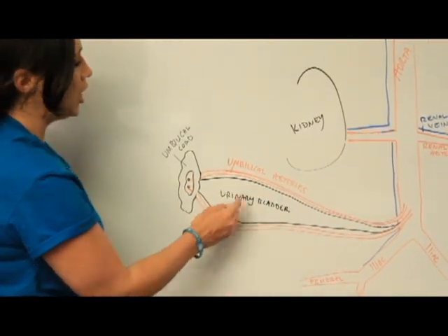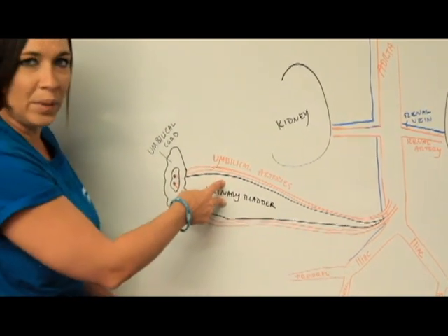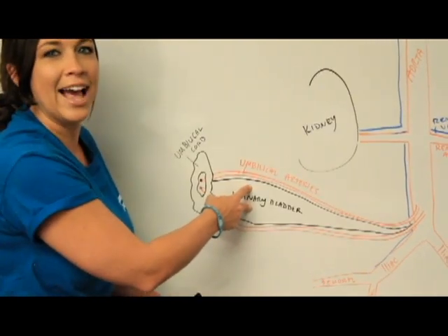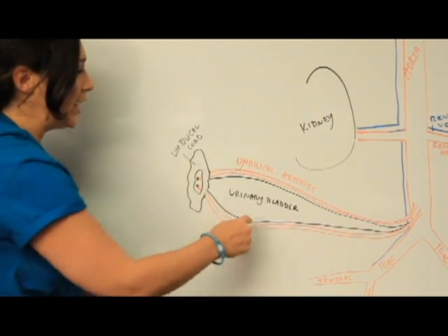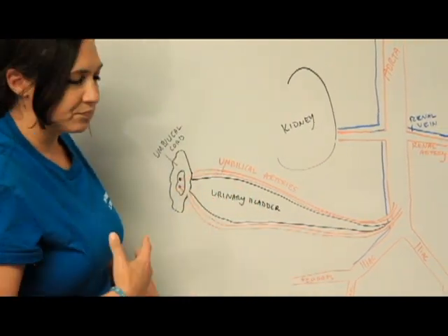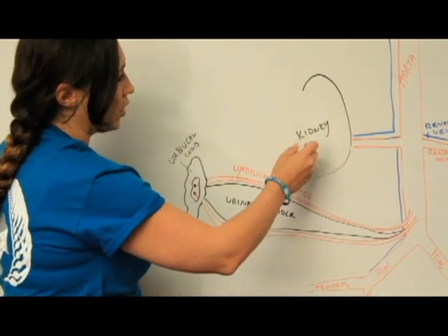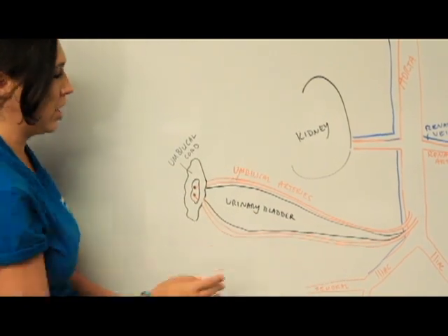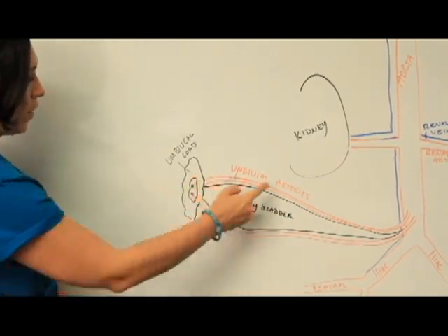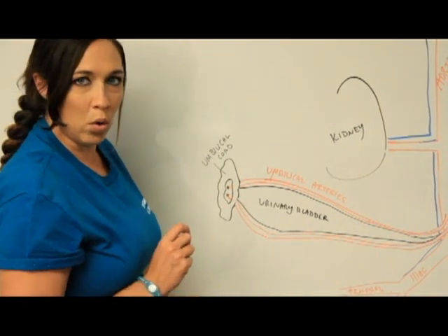And sitting in between both of your umbilical arteries on either side is this giant bladder thing. And it kind of looks like a little sac. And that's your urinary bladder. And again, because that's where it's going to lead to your urogenital opening and release this urine that is going to be basically stored, filtered in the kidneys and then stored in this urinary bladder. So these umbilical arteries are going to be going up near the urinary bladder attached to your umbilical cord.